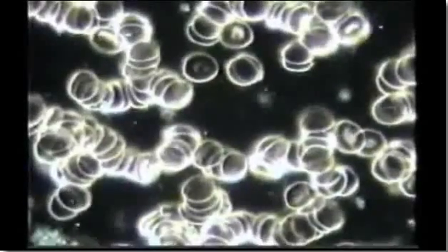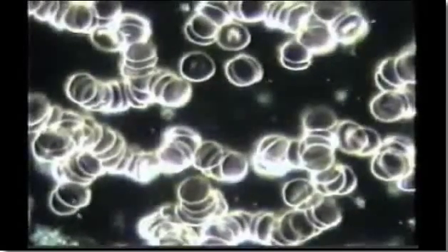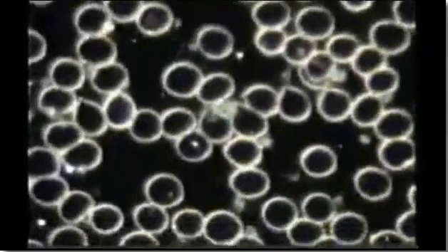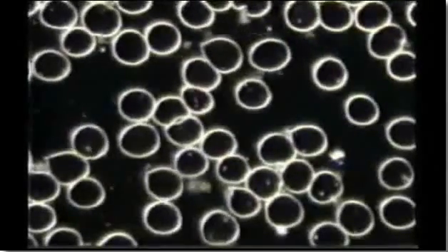Subject number 4 is a lady and we can observe again the agglutination. After 15 minutes of wearing the pendant, look at how well her blood is oxygenated. The red blood cells are nicely shaped and repel each other.